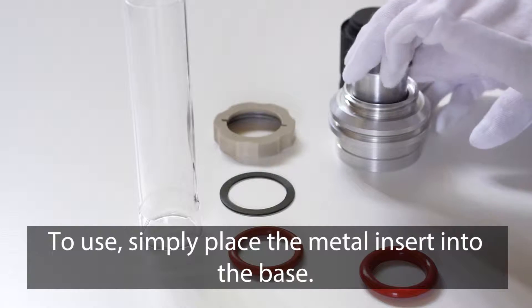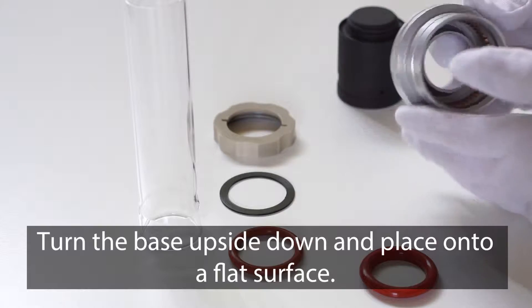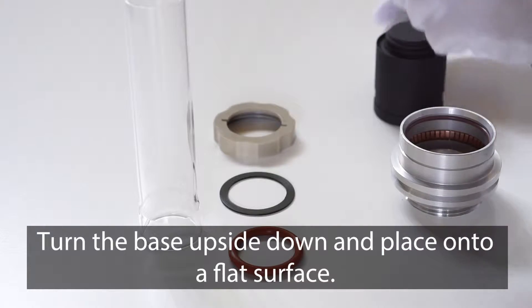To use, simply place the metal insert into the base, then turn the base upside down and place onto a flat surface.